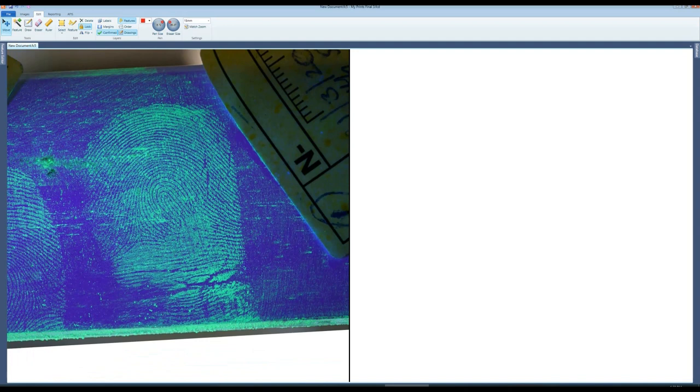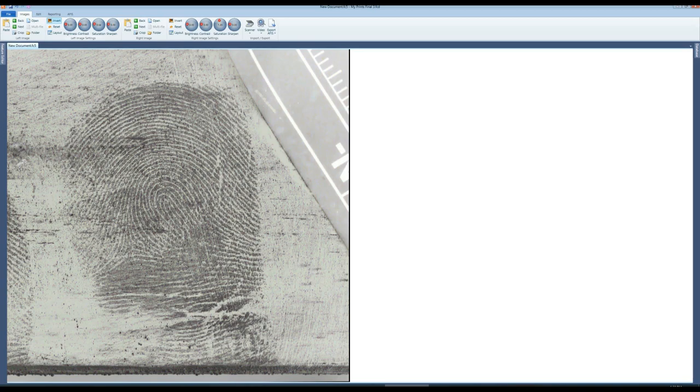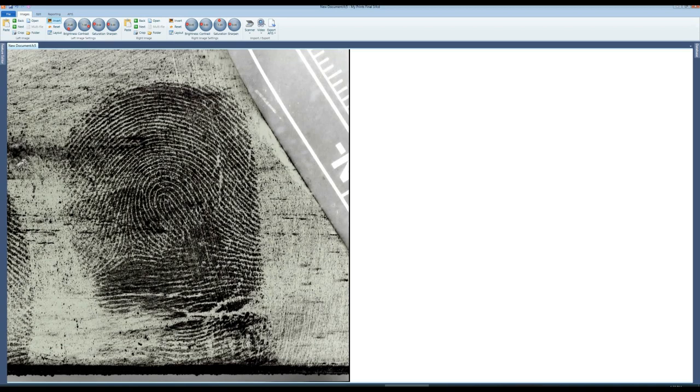I will now use some enhancement tools. Select invert to invert the colors. Then saturation to convert to black and white. Brightness and contrast can be then used to highlight the ridges. Brightness down and contrast up usually works well.